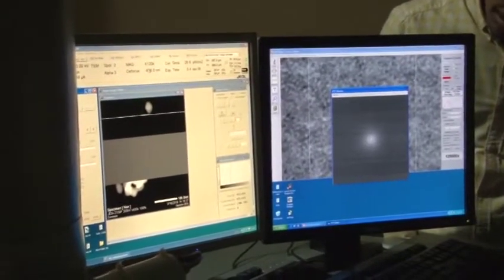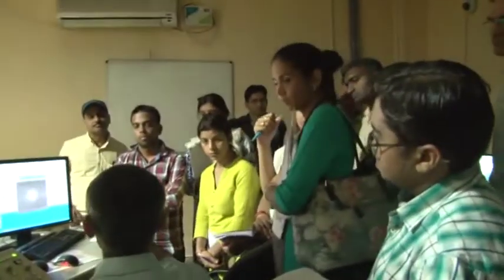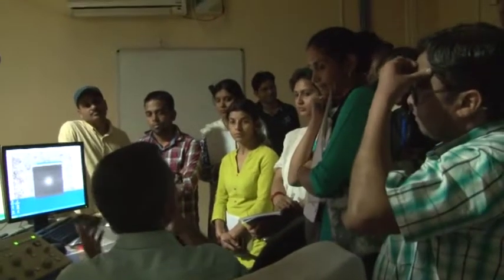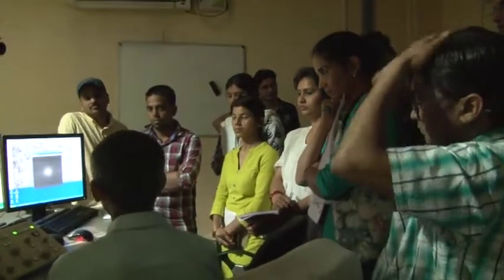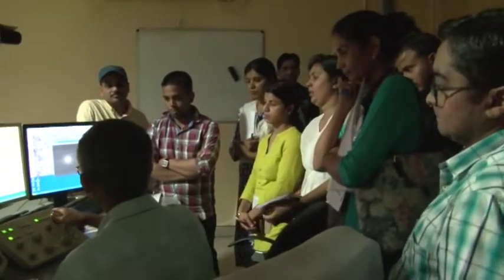Okay, so somewhat. So every time we have to do this exercise. I mean, if you are doing high resolution, then one has to be more careful. But for routine diffraction contrast imaging, as I said, you only usually end up checking. Most of the time, it's okay. So, we have done the alignment, and now I will.